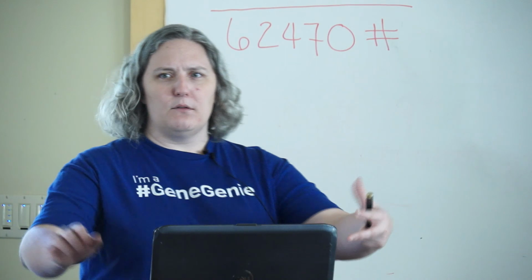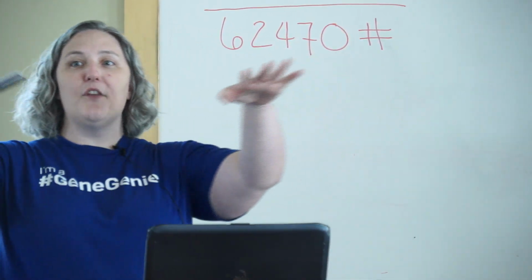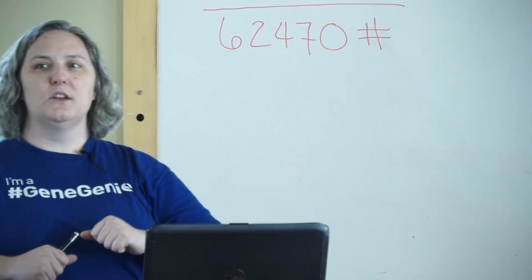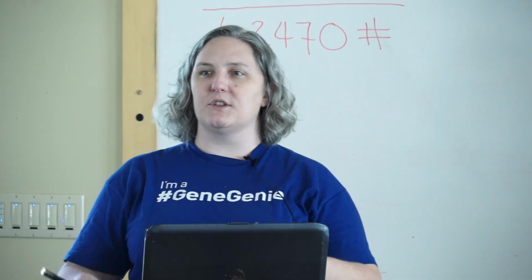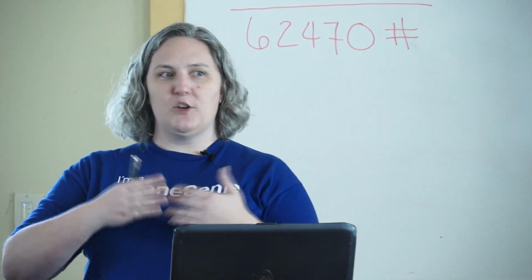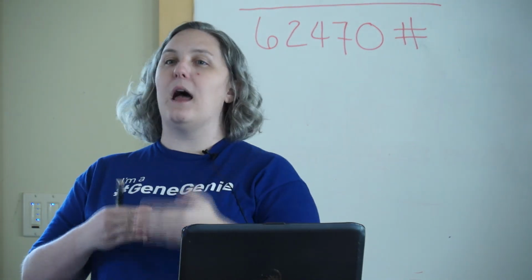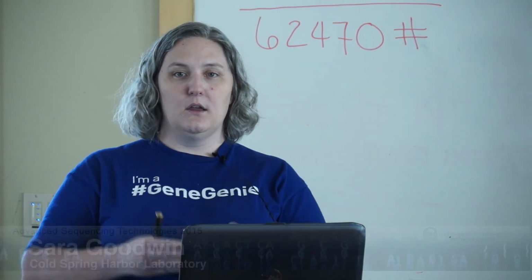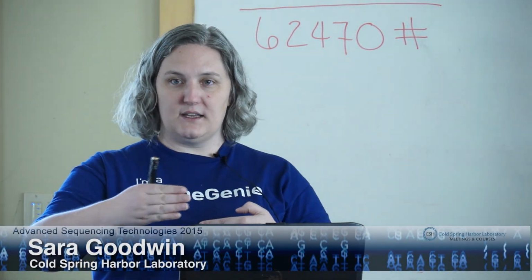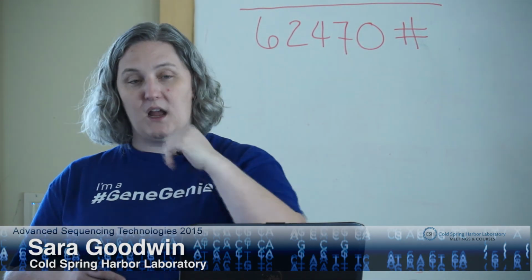Okay. Now, I've got template, I've got complement, I've got predicted events. There's another layer of modeling on top of that. So I've got a forward and a reverse value for each strand, hopefully. Now those should be complementary to each other. We should know what each piece is. So now the algorithm during base calling will take those pieces and go, okay, I know this one goes here in order for the template and complement.